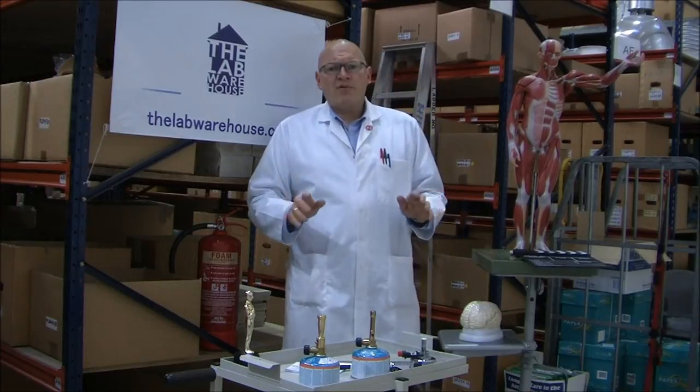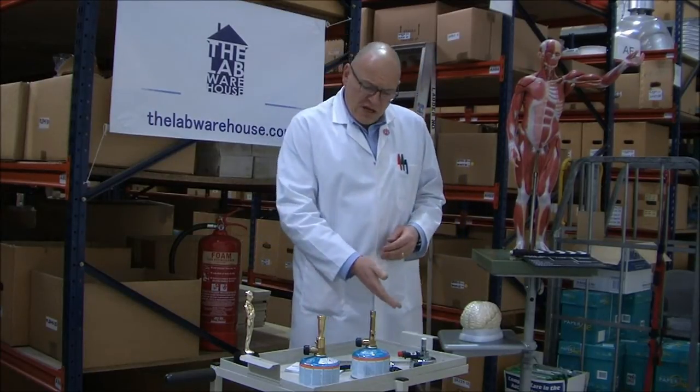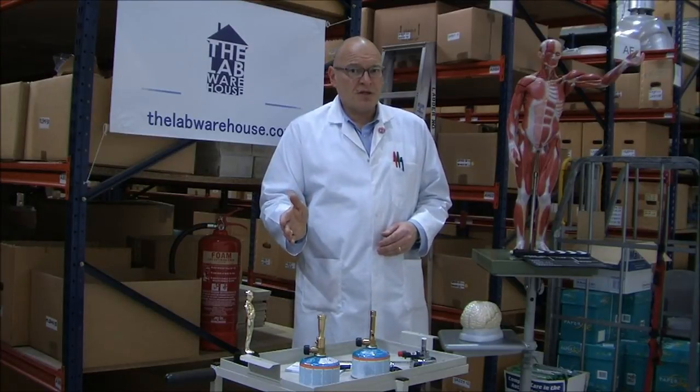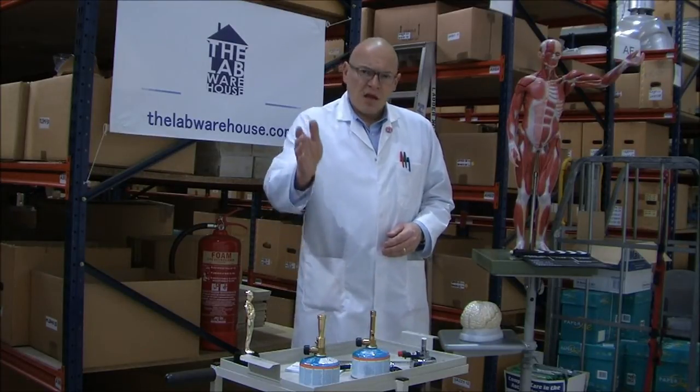Well, here at the Lab Warehouse, we thought of that — with a neat range of three portable, self-contained Bunsen burners. Let me show you them.